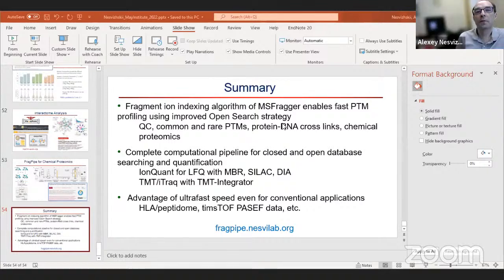Okay, well, the number of identifications always drops if you do MS3 based. I want to say the number of PSMs will probably drop 20-30% at least. The number of proteins that drop will be less, maybe 15-20%. Yeah, there is certainly a drop in the number of IDs if you have to acquire additional MS3 data, right? That's why CPTAC, for example, uses an MS2-only approach.